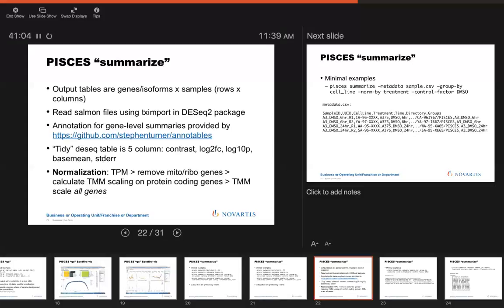determined that there are certain subsets of genes that are problematic in that sample. So mitochondrial and ribosomal genes, so not ribosomal RNA, but genes that encode the ribosomal proteins. Those are problematic. So I exclude those from any normalization calculations. Mitochondrial genes, those also tend to be problematic. For certain indications, you have lots and lots of non-coding content, like I would keep mentioning. So if you don't care about the non-coding genes, most of the time you can just exclude them from your normalization calculations.